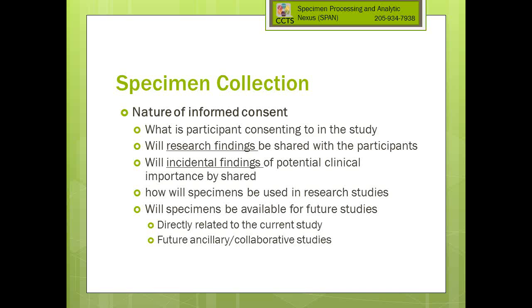And again, this issue of facilitating future studies, that's something that's been particularly useful in our work in autoimmune diseases. We've been very fortunate to collect a very large biobank of specimens from patients with lupus from multiple institutions, and with appropriate consent, we've been able to form a number of collaborations over the years that have led to many, many more studies that have come out using our specimens and working with us directly to utilize those materials to further our understanding of the genetics of lupus. So it's really important to think about your informed consent process and to ensure that you're writing it so that it's fair to the patient, that you're upfront in what you want to do with the samples, and what might happen in the future.